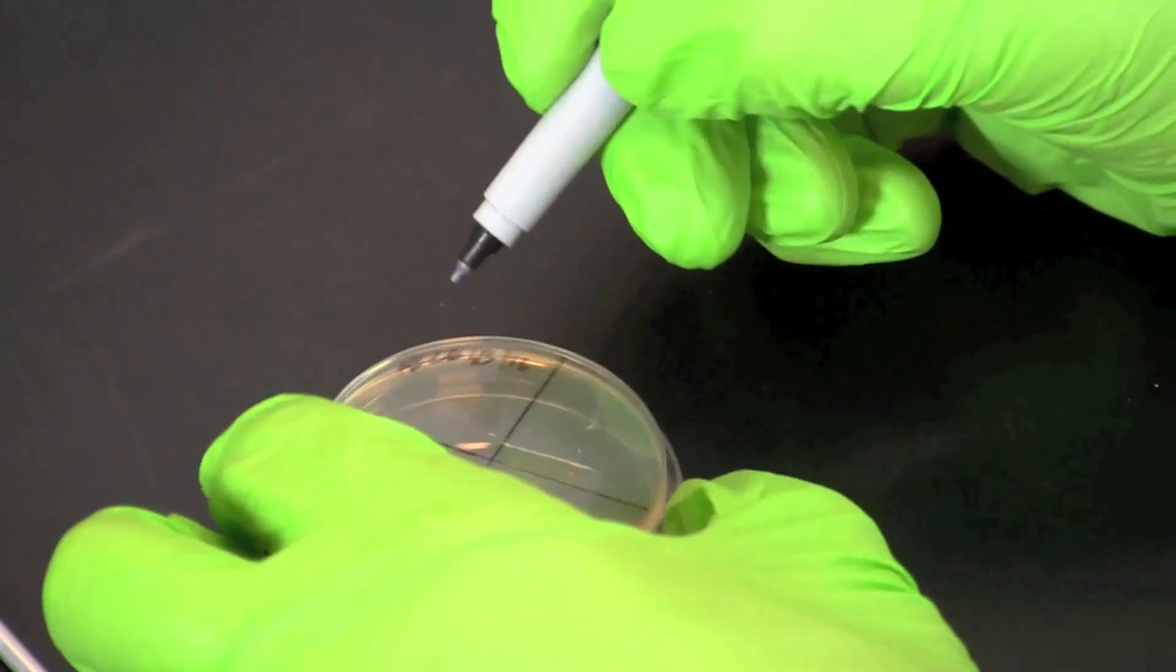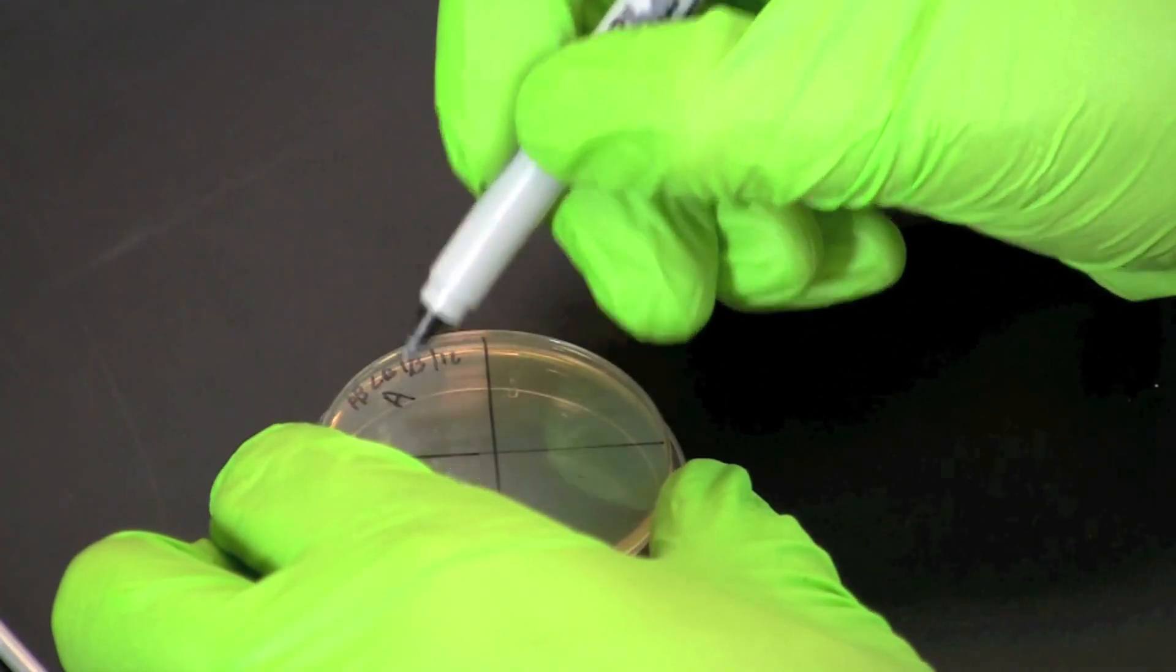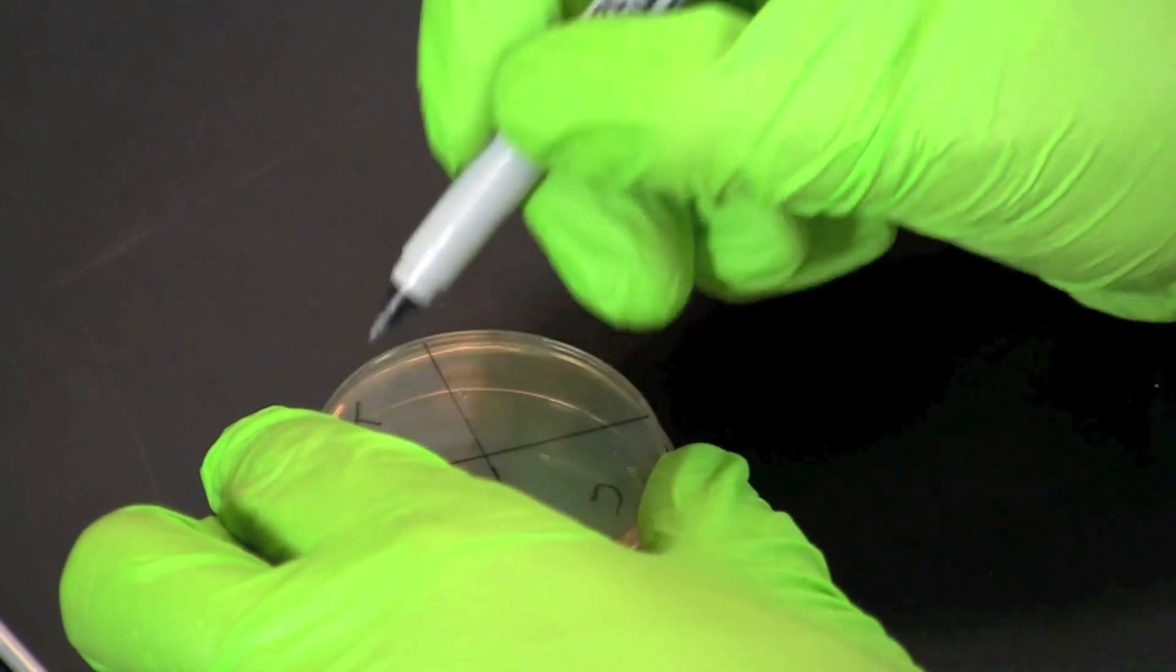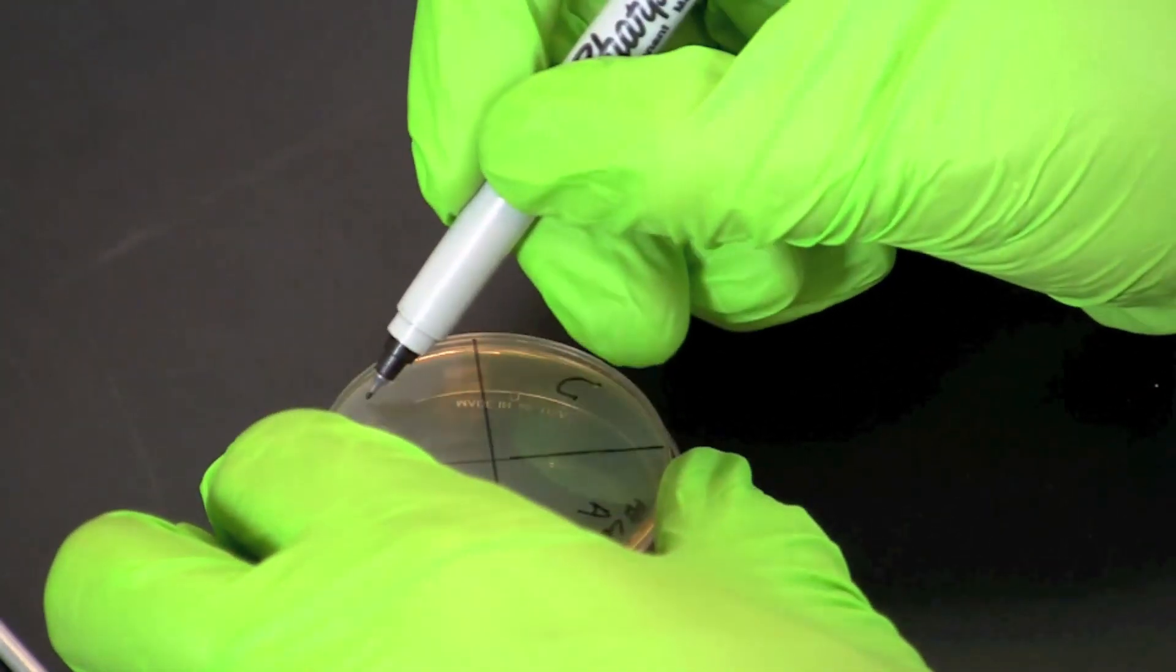Label the quadrants C, A, T, and K for control, ampicillin, tetracycline, and kanamycin.